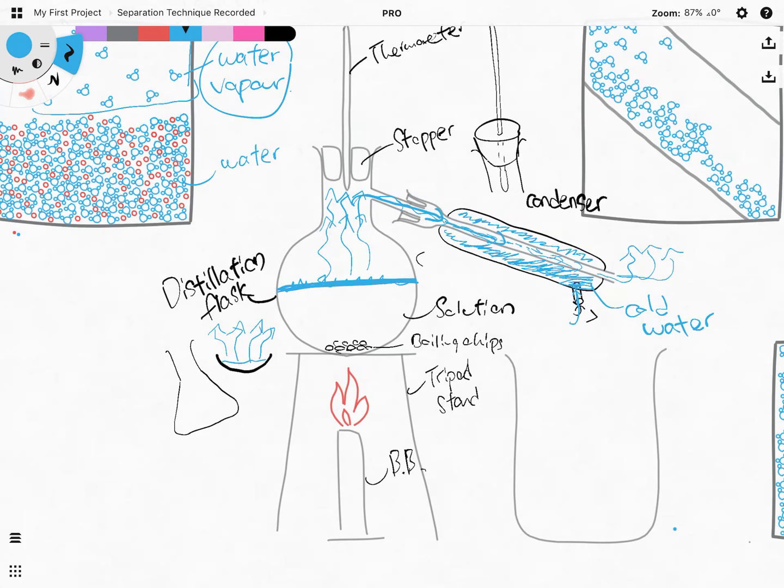So you see, all this hot water vapor that's going through, it will begin to cool down and condense. It will condense on the inside. I show you that there's one tube over here to bring cold water in, right? Eventually, this cold water inside here will start to warm up because the thermal energy is transferred from the water vapor through conduction into the cold water. And then eventually this cold water won't be cold anymore, right? It won't serve its function to condense.